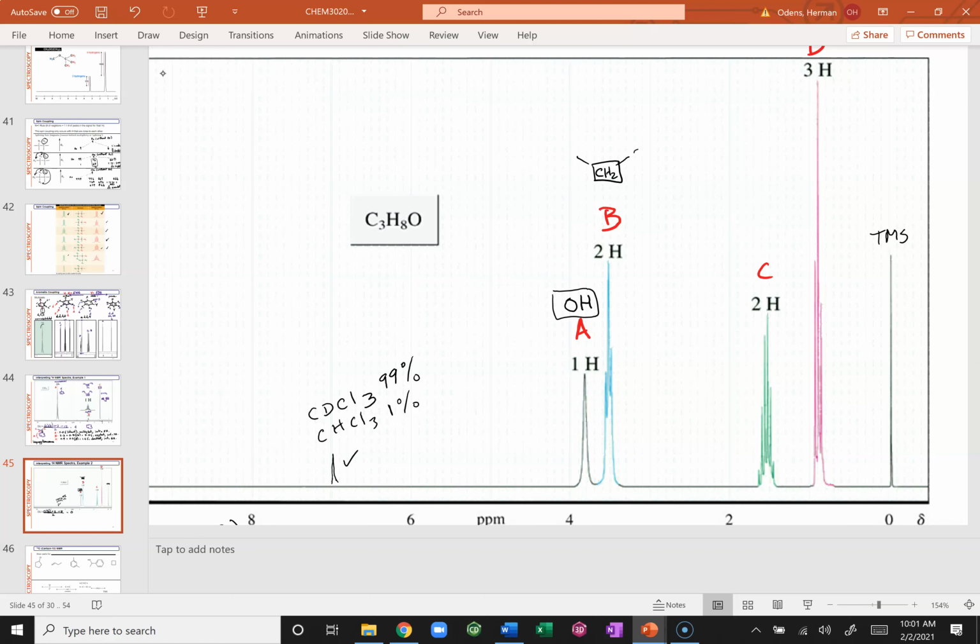I could have a CH, or it could be, simply, a CH2 next to it, right? Make sense? So I'm going to put OR here, because I'm guessing right now. I don't have enough information yet. I do know, but what I'm saying is, right now, at this moment, I'm incomplete. So I'm just going to write whatever I think it could be. All right, letter C. It integrates for 2. So what are we dealing with here?